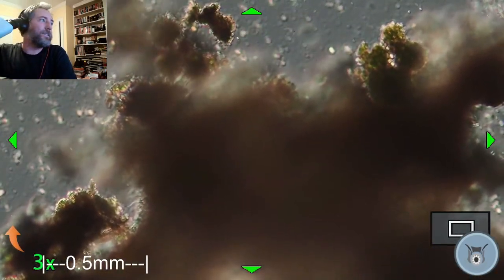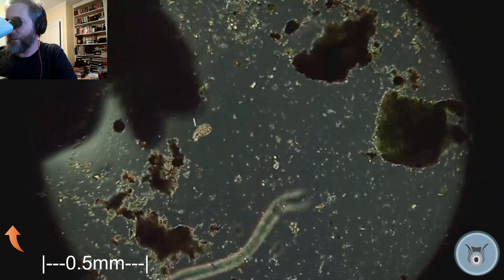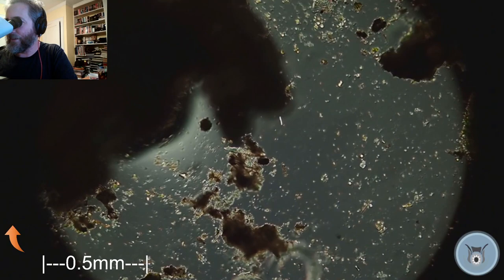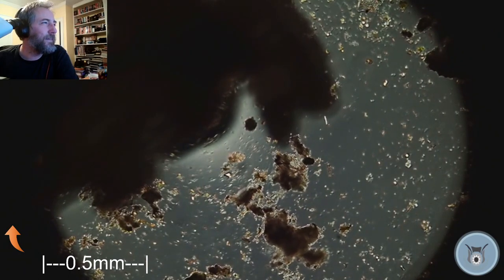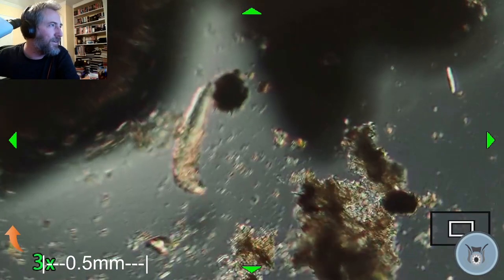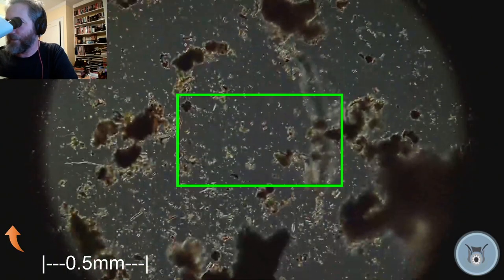We might have to find another one. It seems like that one just disappeared on us. Probably went behind something. There's a nematode doing its little dance. There's another one right here. You see this sort of crawl? They push their head forward, stretch out, and then inch their way around. And on the back end of that, you would see it's right at the meniscus for this material that's on the stage, which makes it a little challenging.